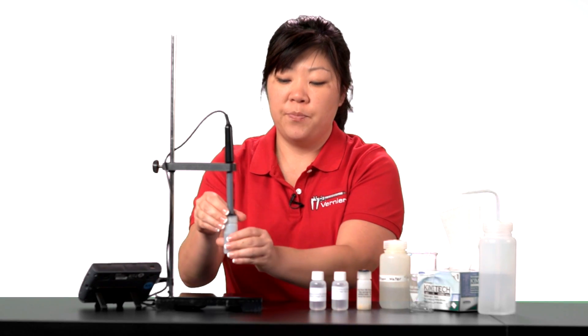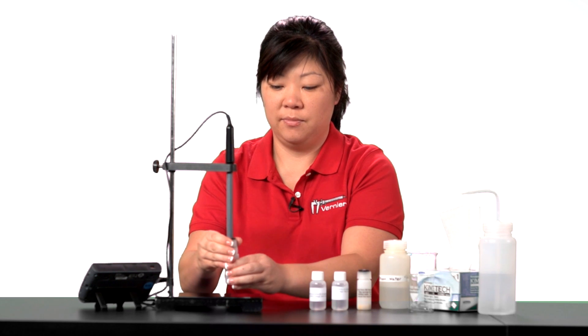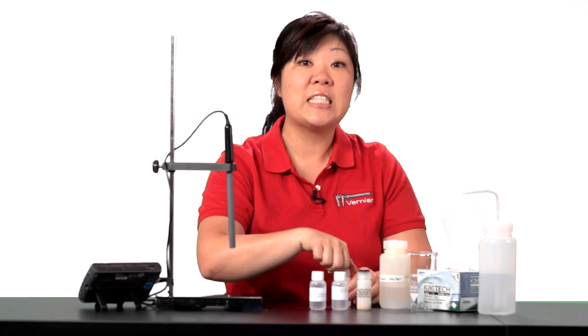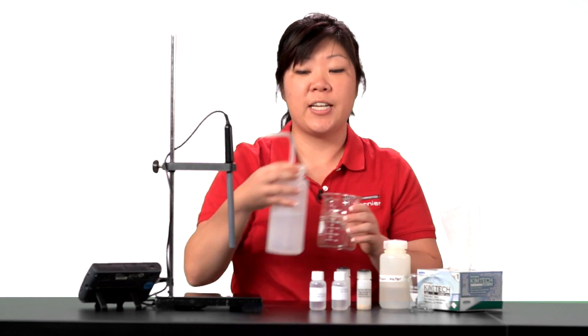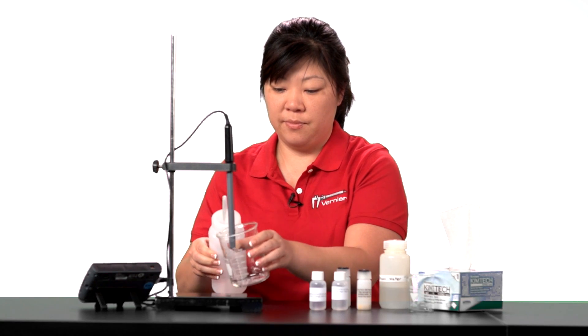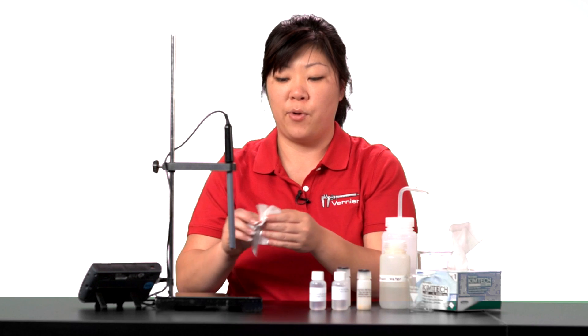Remove the sensor from your high standard. Thoroughly rinse the tip with distilled water to prevent contamination of your low standard. Then gently blot dry using a paper towel or a lab wipe.